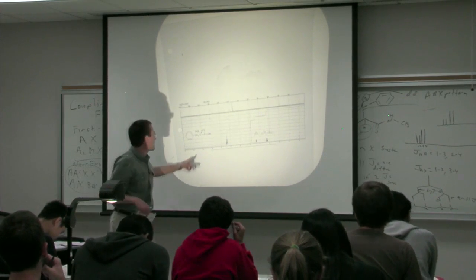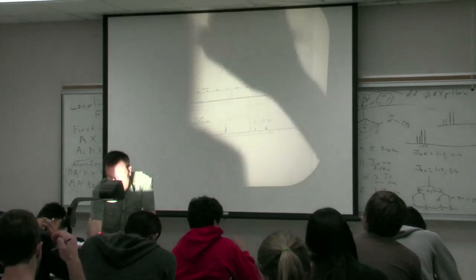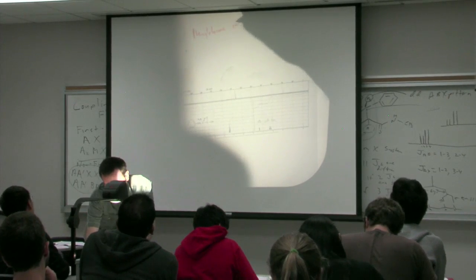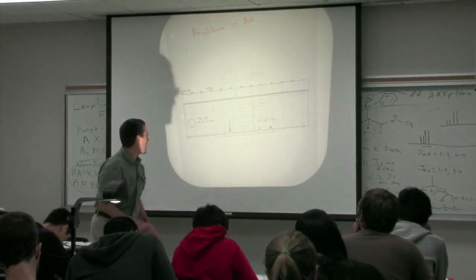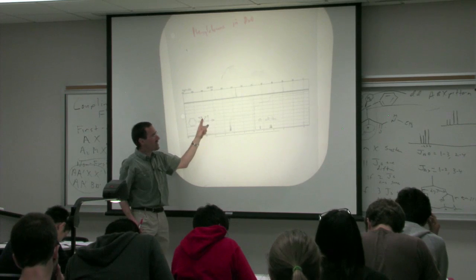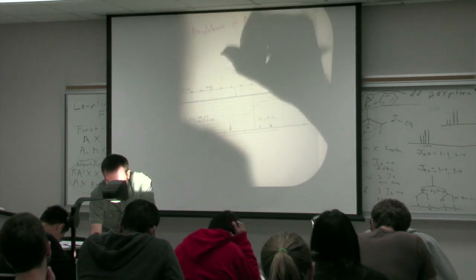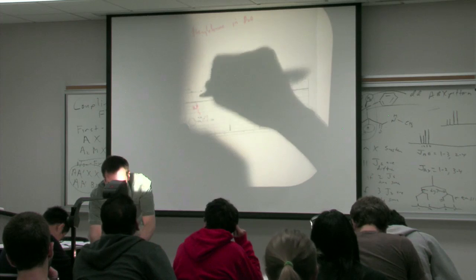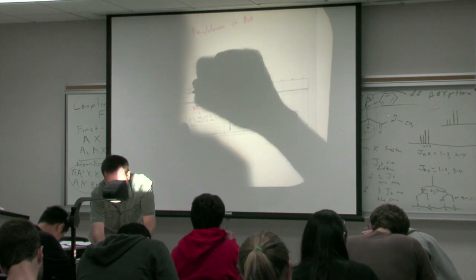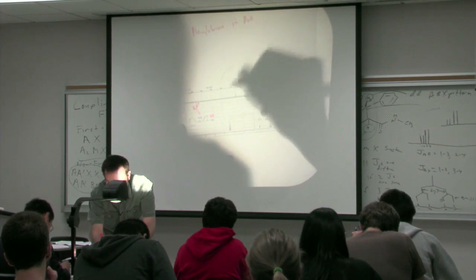And so here we see a real compound. I've shown you this before. This is phenylalanine in D2O. So unlike the hypothetical example I gave in chloroform, this one doesn't have an amide here. It has an amine here, and it has a carboxylic acid. In D2O, those exchange, and so this becomes ND2, and you essentially see no coupling. And actually, there's DCl here, so this really becomes ND3 plus, and you don't see coupling, and this becomes D.